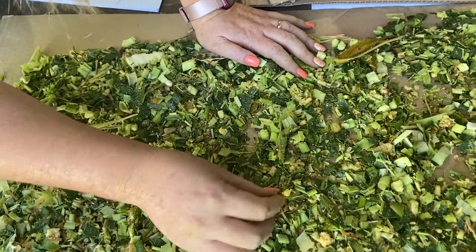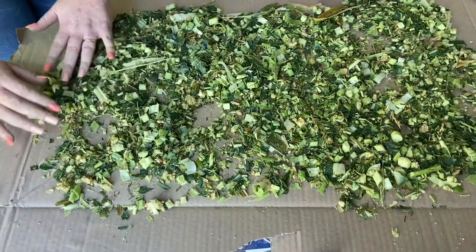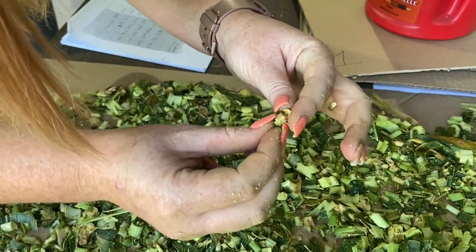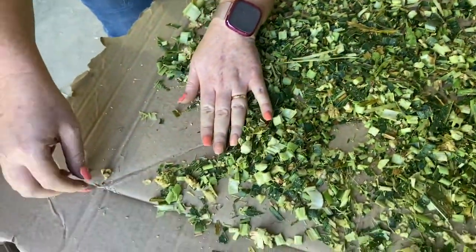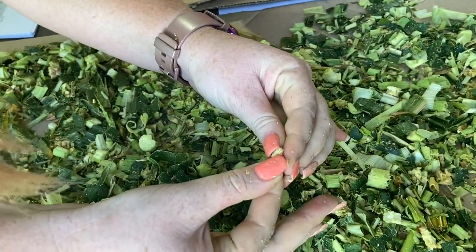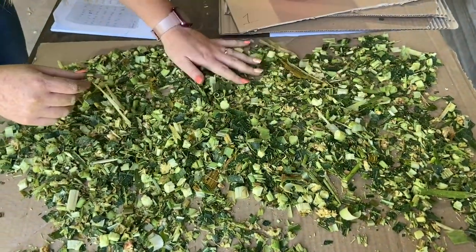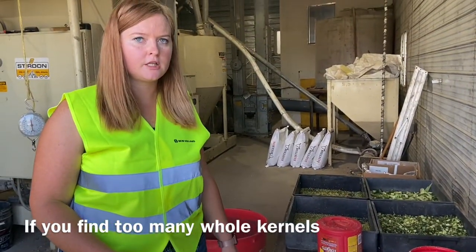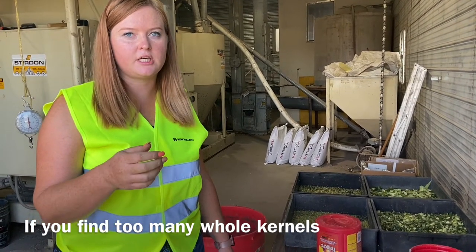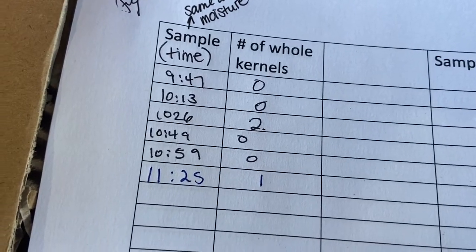This kernel looks whole but it's not. Here's two — they're attached to each other. That one has a nick actually. This one does not, so that's definitely one whole kernel. This one does have a nick on it, so it's processed — that's fine. If you find too many whole kernels, the kernel processor needs to be adjusted so it's a smaller gap that they go through, so that the kernels are actually damaged for higher digestibility. We just record the time and the number of whole kernels in the sample.